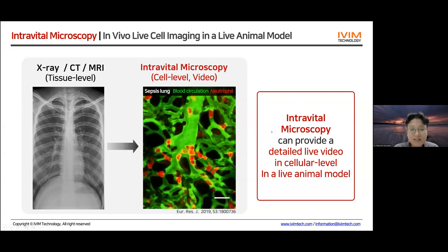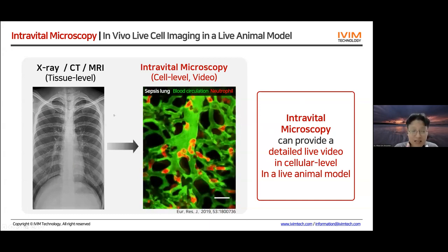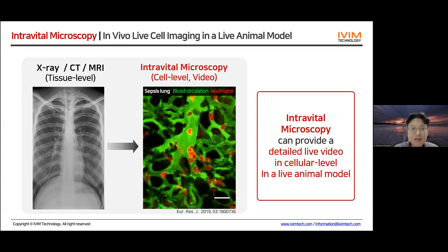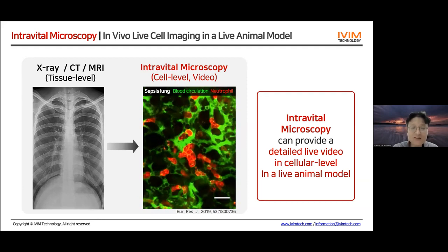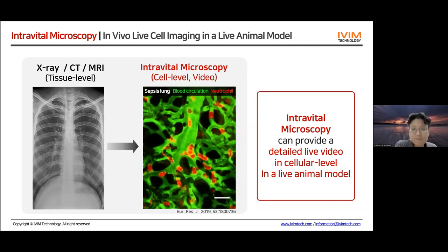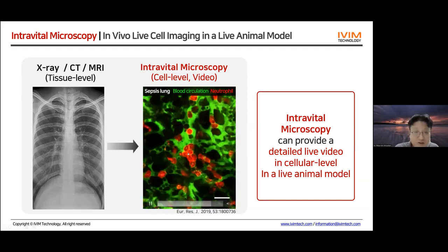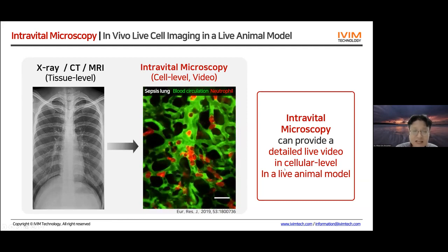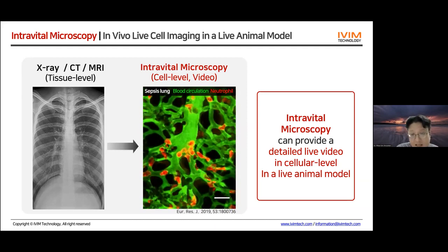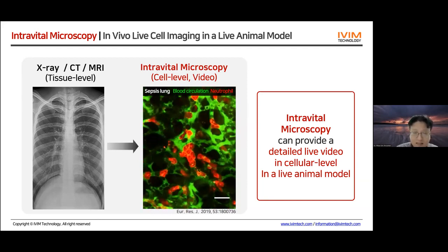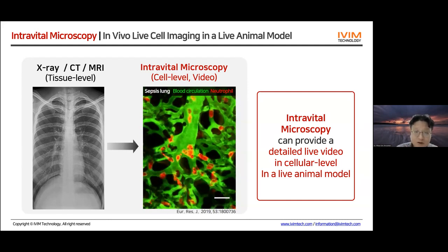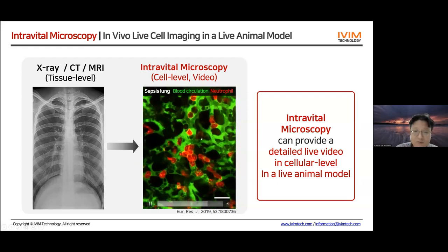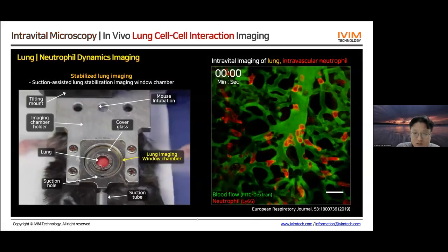This time-lapse video is obtained from the lung of a sepsis mouse model. In green is blood circulation, fluorescently labeled by intravenously injected FITC dextran, and in red are intravascular neutrophils inside the vessel. These neutrophils are labeled by intravenously injecting Ly6G antibody conjugated with a red fluorophore, which circulates through the blood and labels all neutrophils inside the vessel in red.